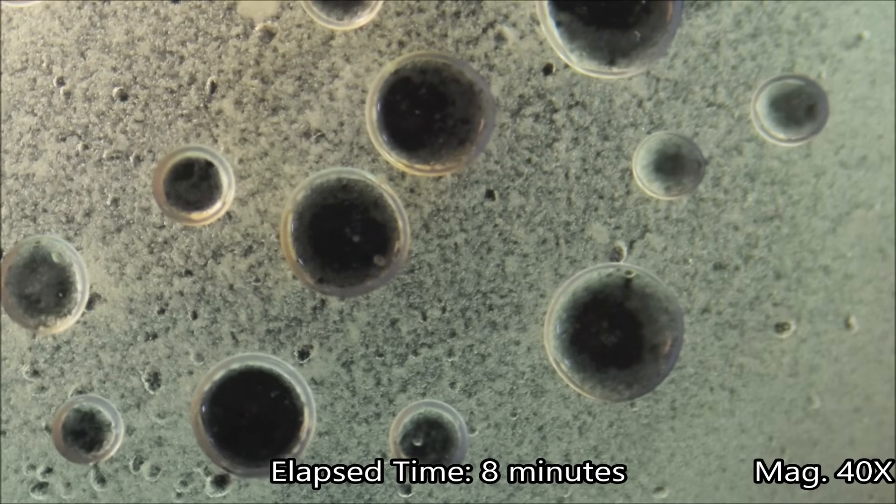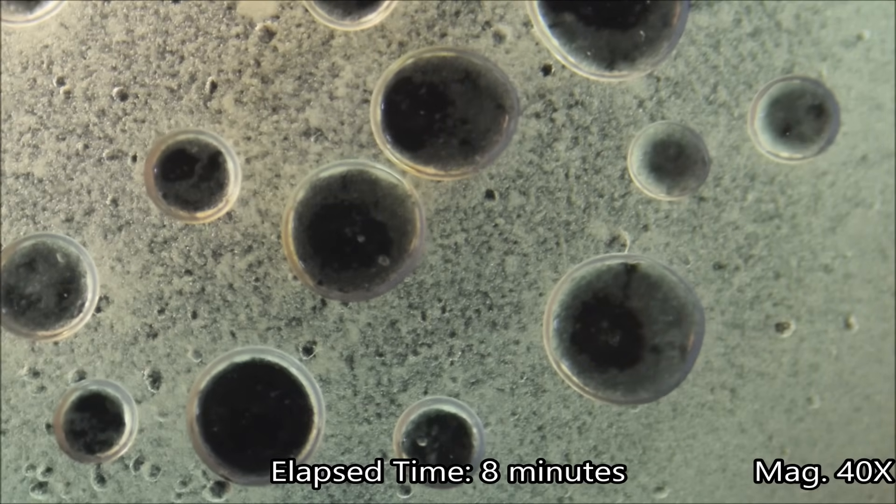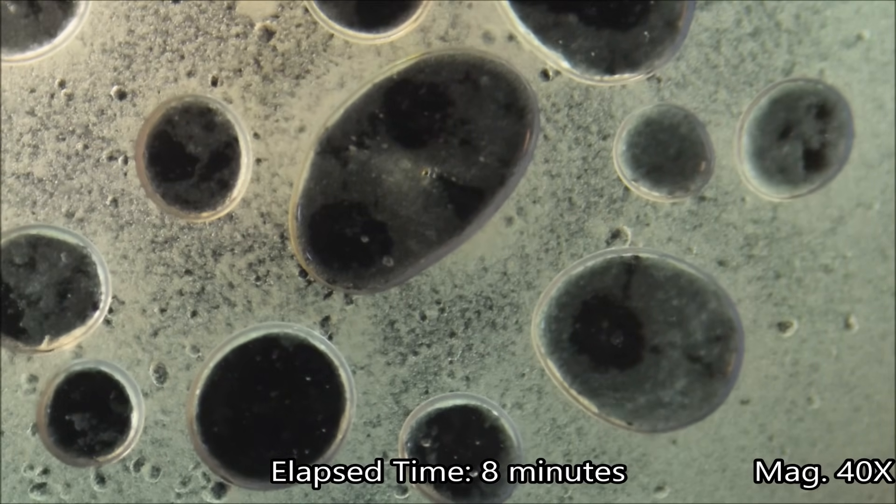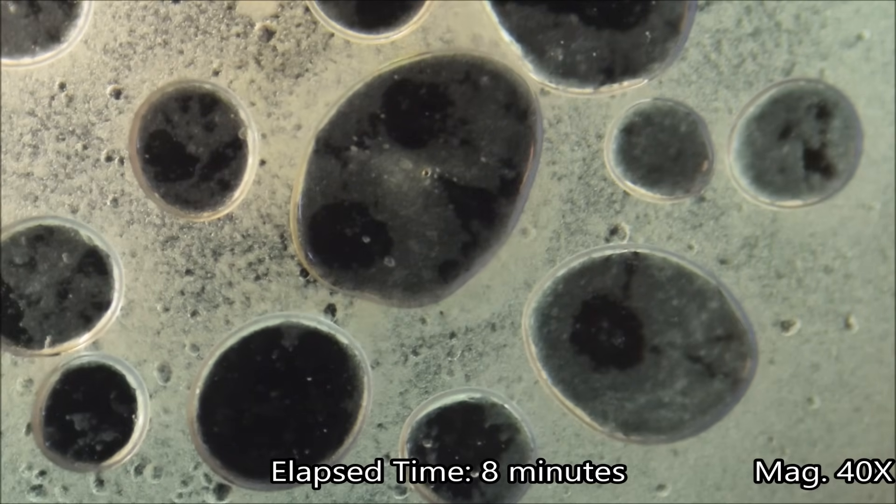Here is sped up footage of carbon dioxide bubbles being formed from the process of fermentation by yeast. Fermentation is when an organism breaks down carbohydrates for energy in the absence of oxygen.